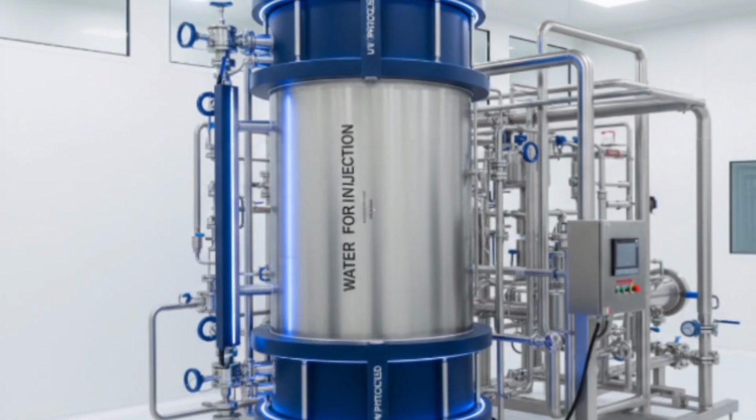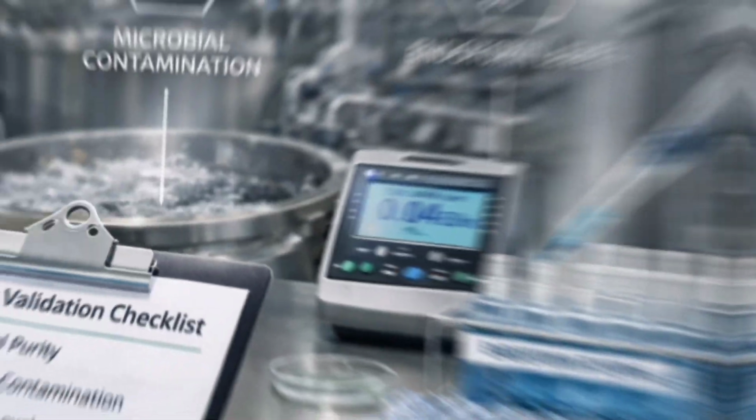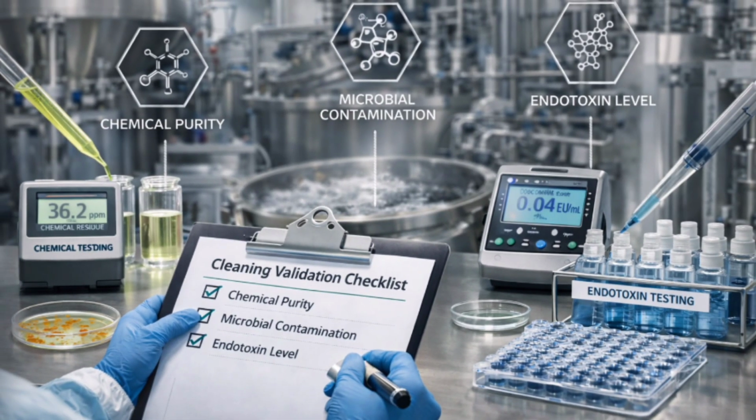The quality of water should be maintained within the limit for physical, chemical, and microbial parameters. The purification of the water system, like multigrade filtration, ultrafiltration, reverse osmosis, and electrodeionization, each and every process should be evaluated before the manufacturing of drug products.